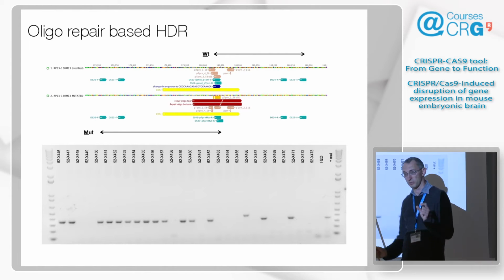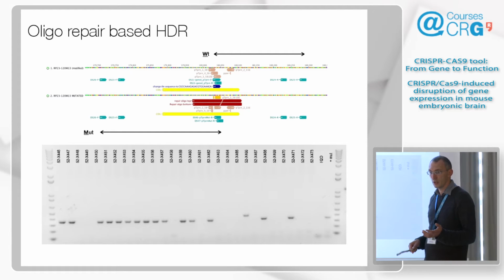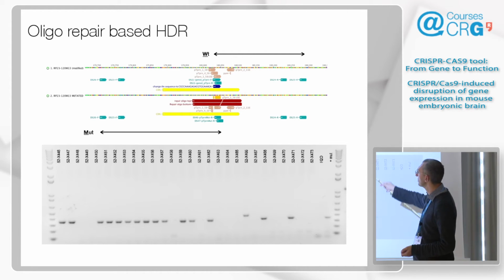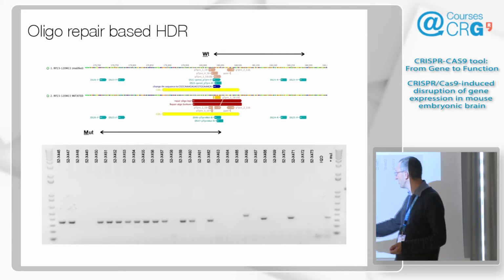As you saw, the edit was big enough, so we can put primers at that position. This is something I recommend in general, if possible, if changing. What we really wanted was 1 amino acid change. All the other mutations are silent. But this makes it very easy to then genotype because you can place primers and you have a PCR that will only identify the mutant.